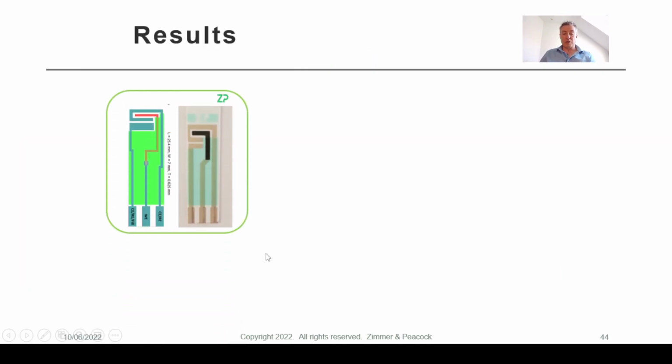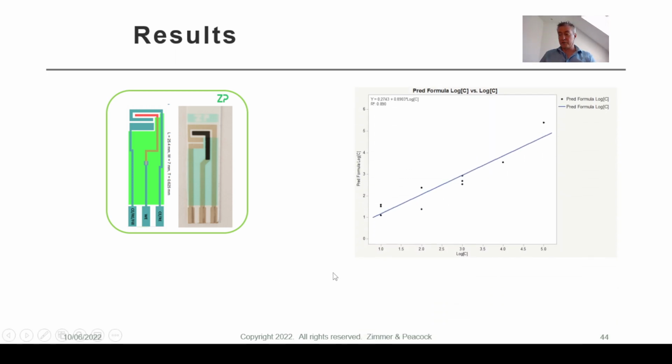It's probably just worth saying that, if we put something like 111 hours into an assay, we can often make things work. I'm not trying to tell you this is the best data in the world. I can see a few problems with our limit of detection, but it's just to say that making immunoassays is not an 8-hour effort.